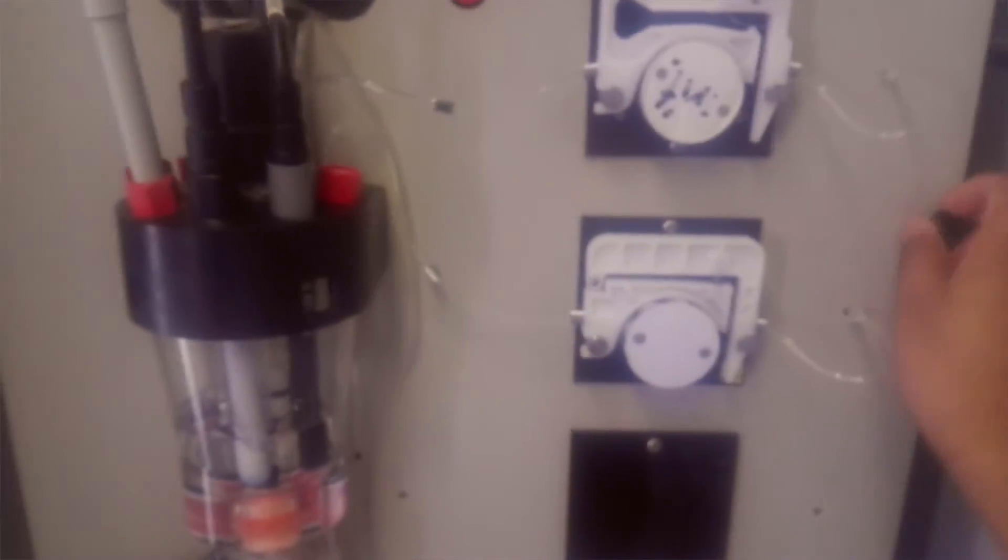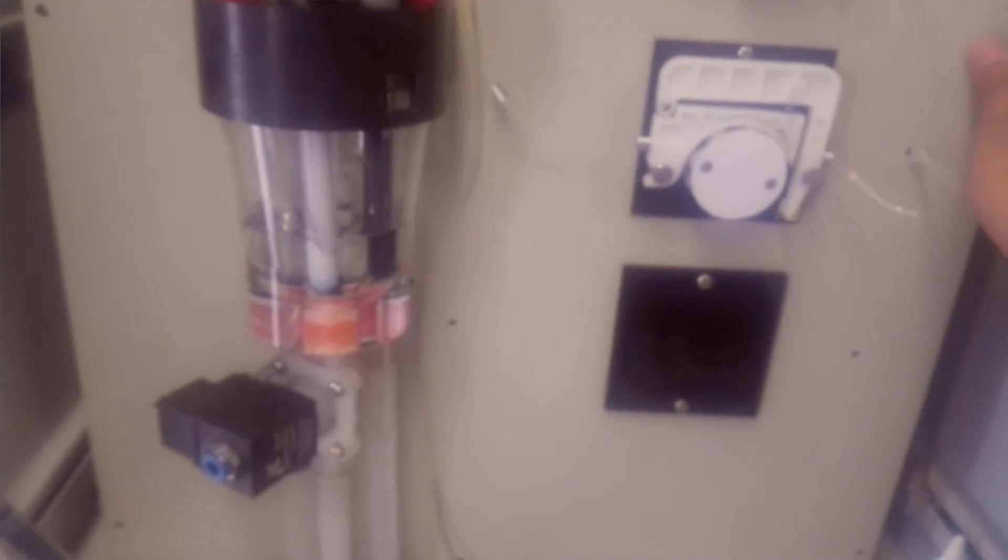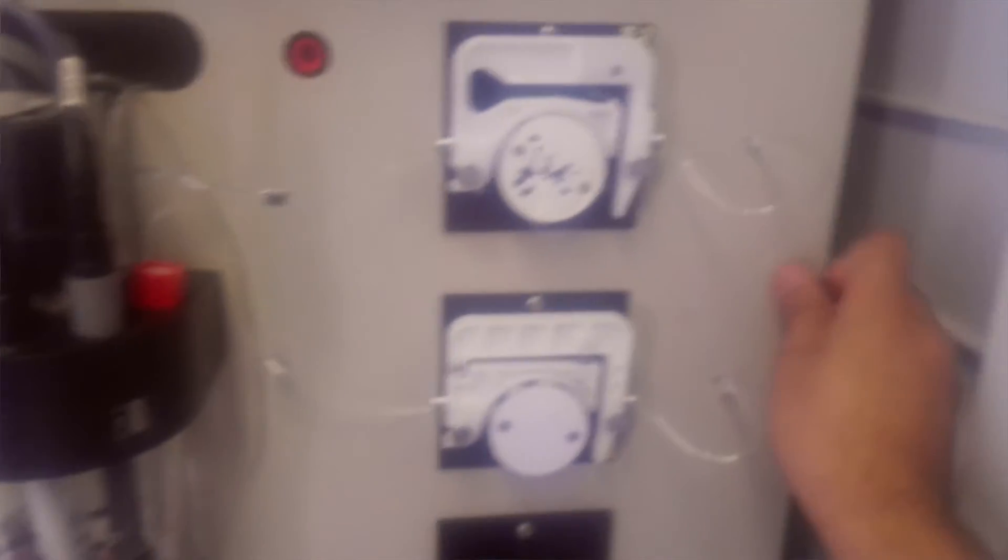Open the panel plate by unscrewing this knob. Open slowly and carefully because there are sample water, deionized water, and pneumatic air connections which can be disconnected.